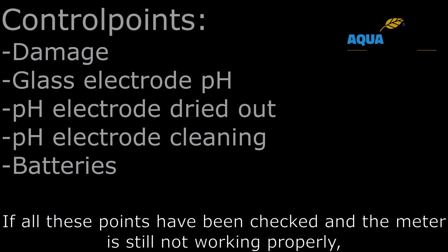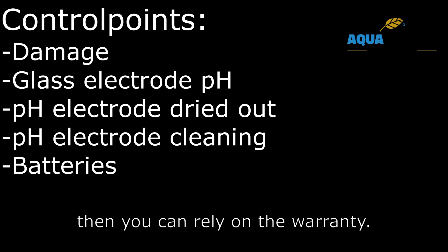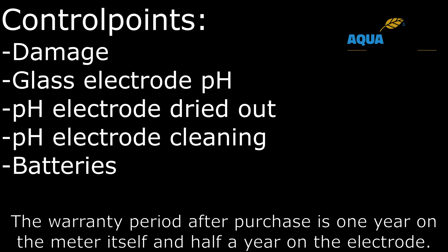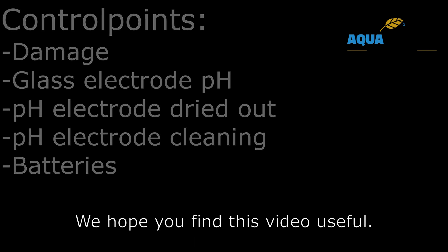If all these points have been checked and the meter is still not working properly, then you can rely on the warranty. The warranty period after purchase is one year on the meter itself and half a year on the electrode. We hope you find this video useful.